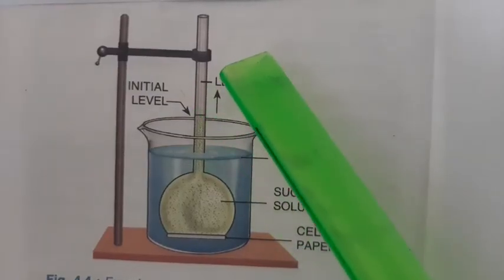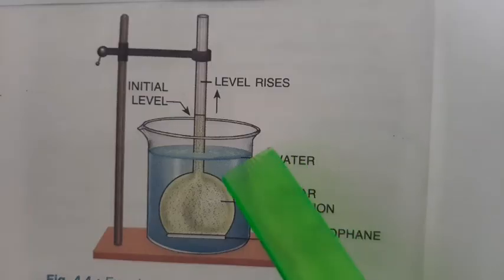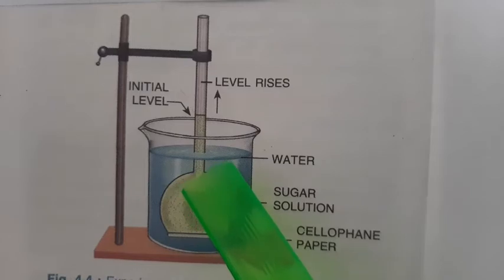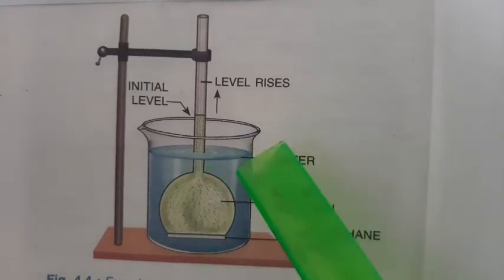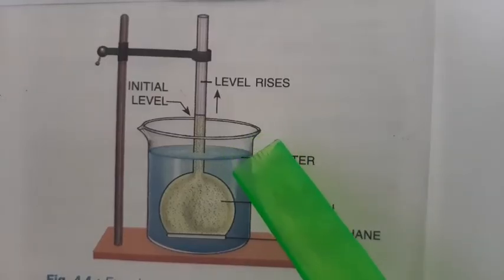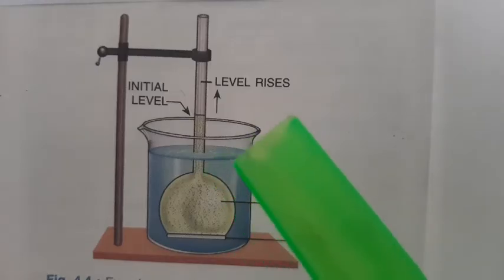From this we can conclude that water molecules from outside have entered the thistle funnel. Secondly, when the water outside is tasted, there is no sign of sweetness, which means that sugar molecules have not come out from the thistle funnel.